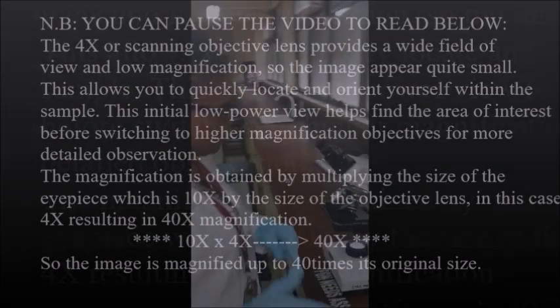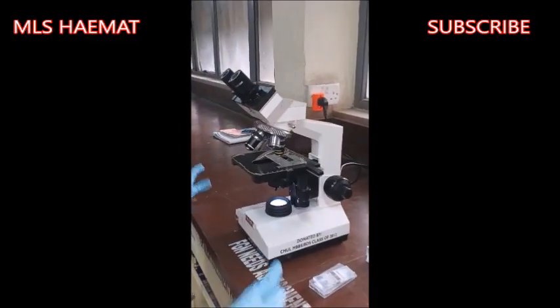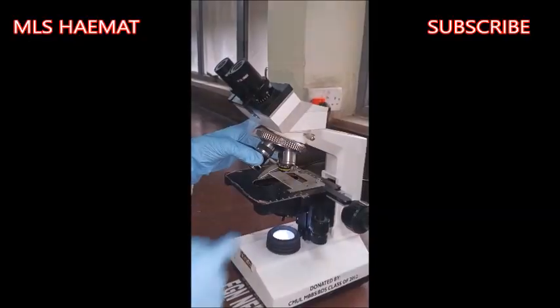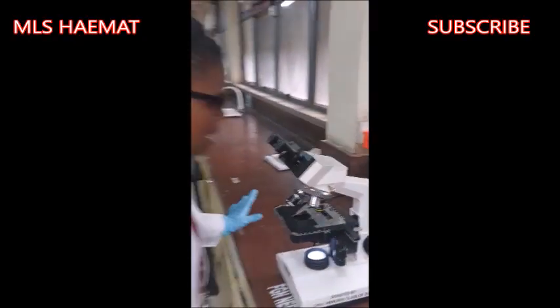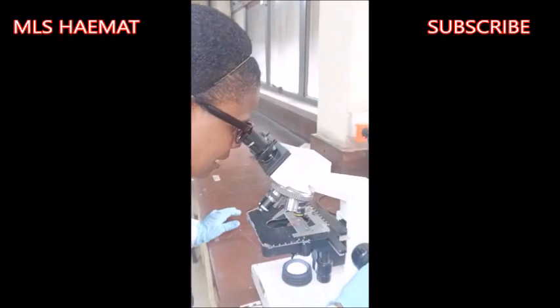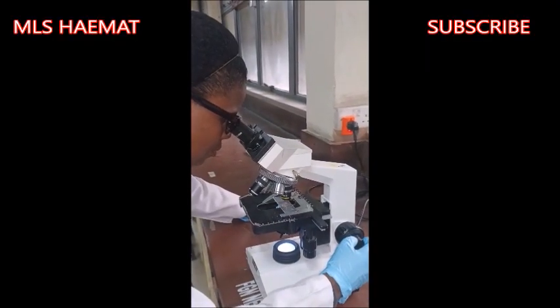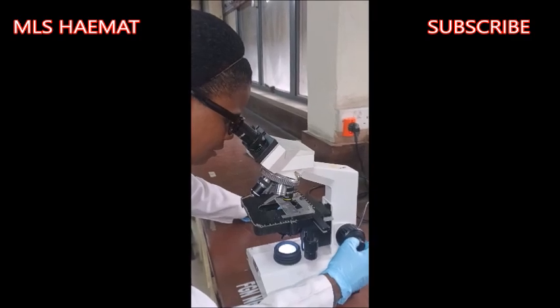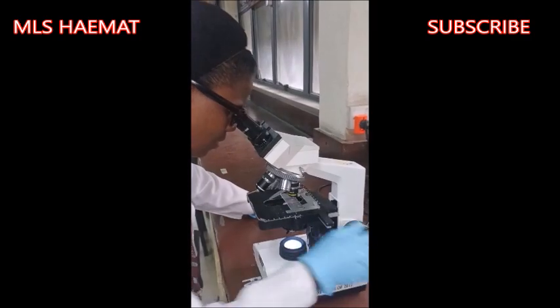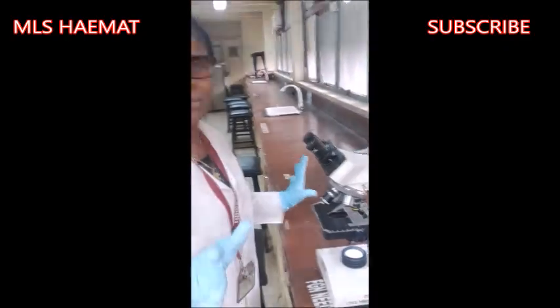The next thing I will do is to turn this to ×10. As in, I will rotate the nose piece. This is the ×4. Rotate it to ×10. And now that I have the ×10 in view, the next thing is for me to just use the fine adjustment. I'll just raise the fine adjustment. And now I can see the red blood cells under the microscope with the ×10 objective.